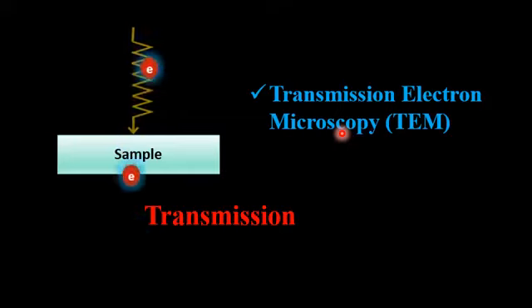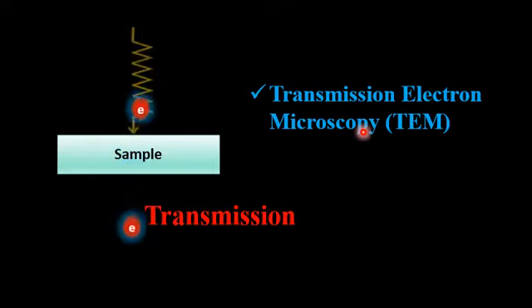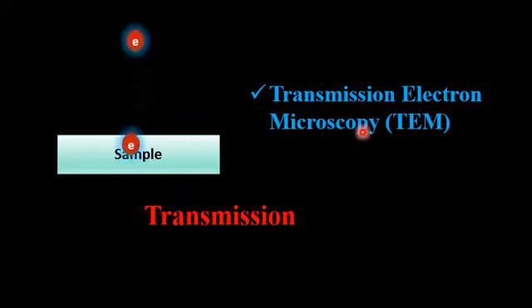The drawback with the TEM is that we need a high energy setup, so a high potential is used in TEM. Another drawback is that the chamber of the TEM is usually under a very high vacuum, so a lot of cost is involved in doing a TEM analysis.